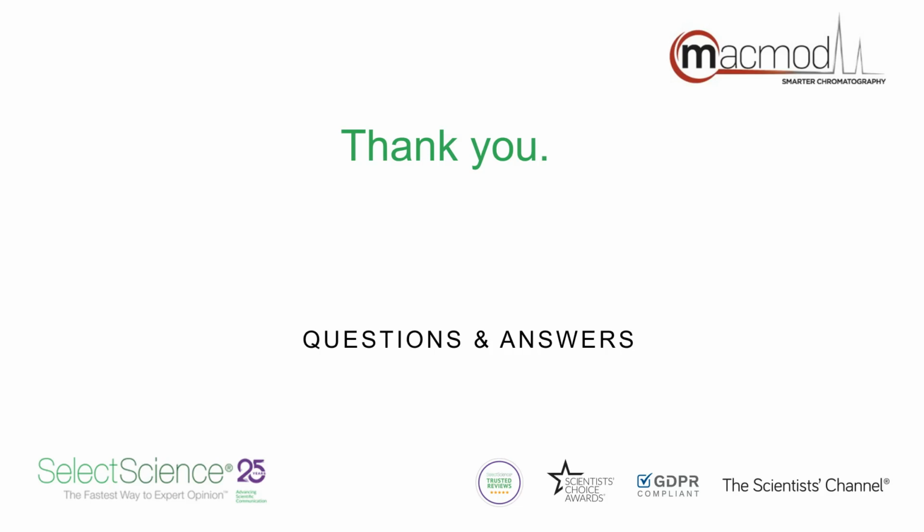Yeah, thank you for that question. I think one of the main aspects of that is we're reducing that diffusion aspect between particles by having less space between them because you have a more packed surface, and that reduces their interaction between particles, and so that allows you to have a much cleaner interaction within the particles. So that gives you a clean response.